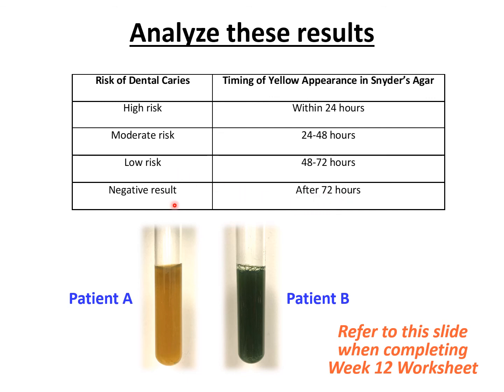After 72 hours, that's it. You shouldn't wait. As I said, maximum, you check it no more than 3 days. After 3 days, after 72 hours, that's a negative result, and you will have to redo the test if you forgot to check on your tubes.